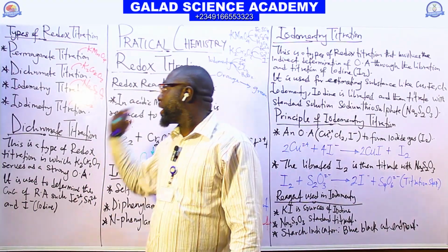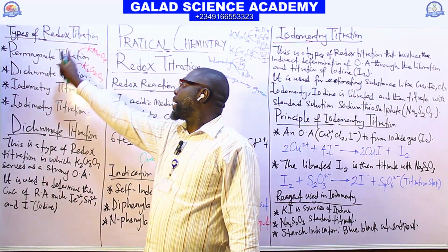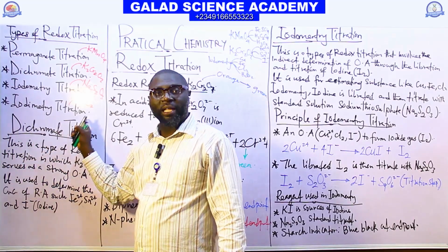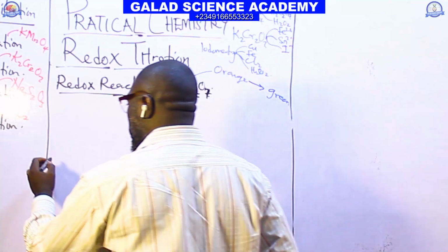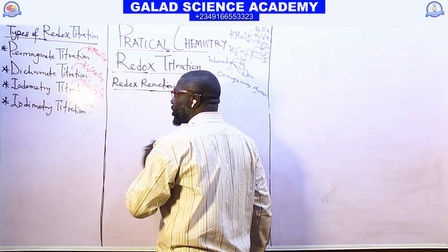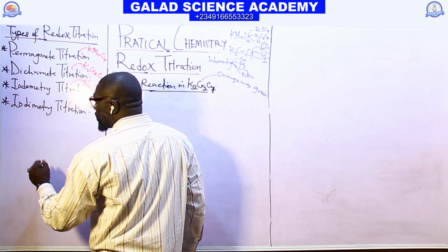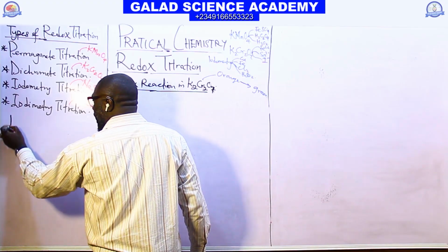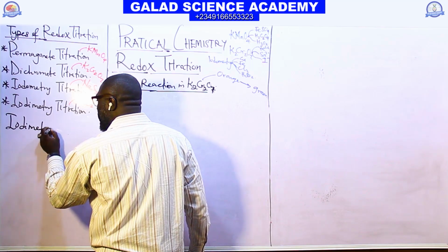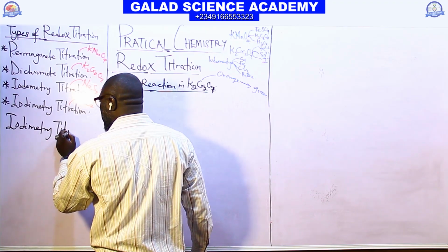So the last aspect of redox titration is iodimetry titration.